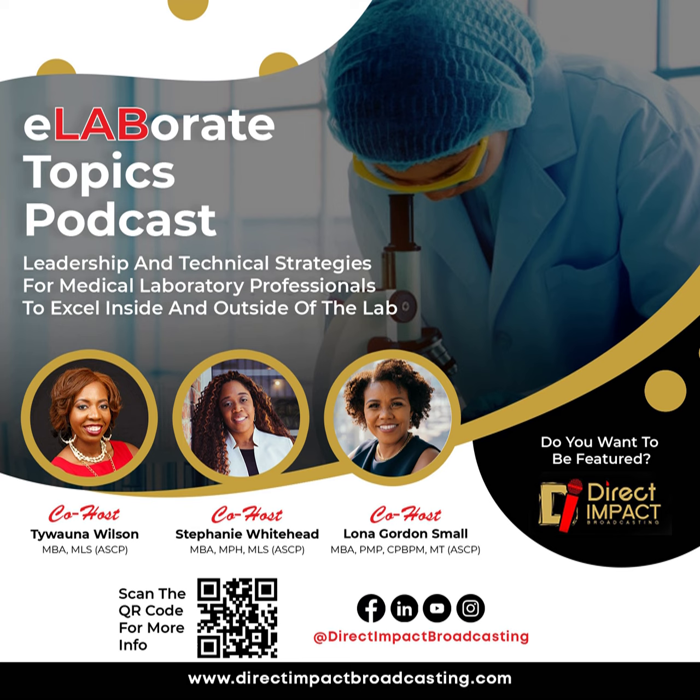So we are getting new equipment, and you're probably wondering, how do I select the best instrument for my laboratory? We're going to talk about that. We're going to give you a few tips and tricks that you can go back and use, whether you are a tech on the bench, these are things that would be helpful for you. Whether you are in management, these are some additional considerations maybe you haven't considered in the past.